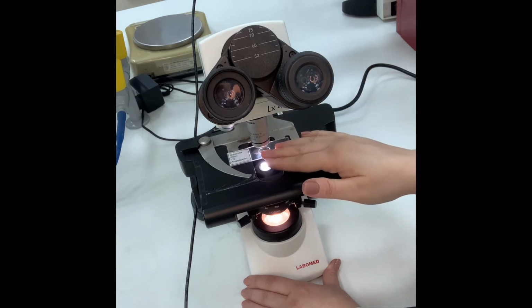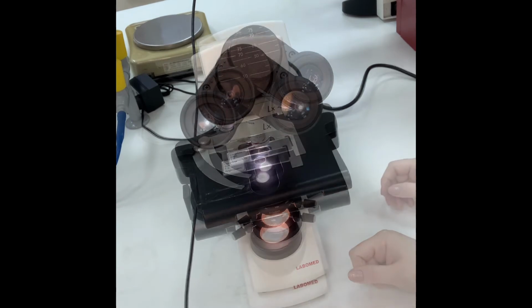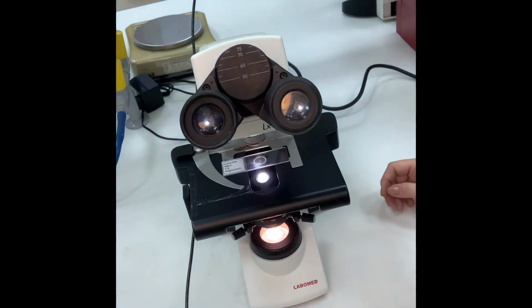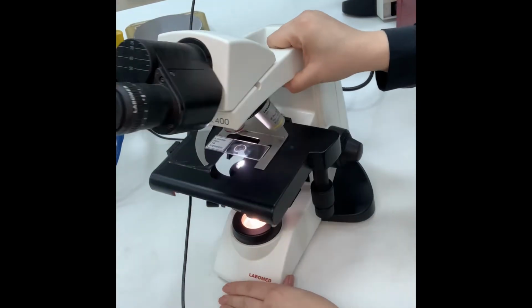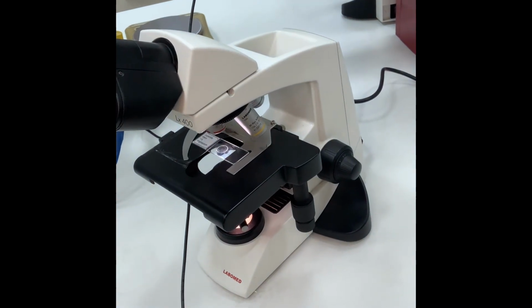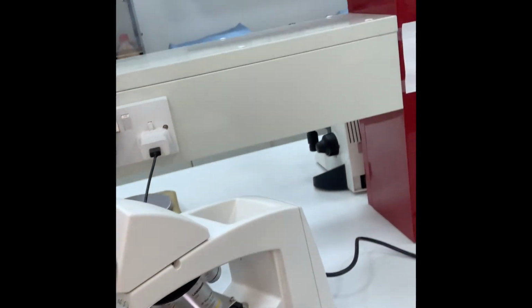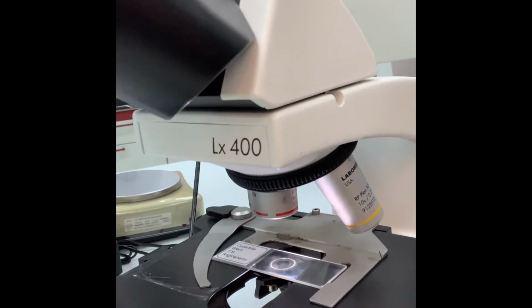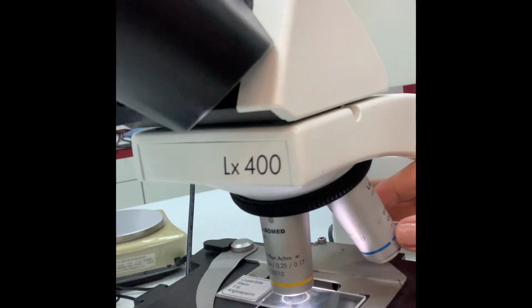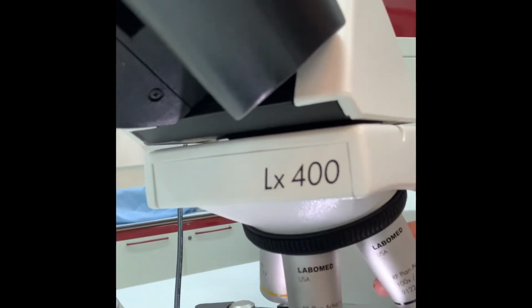Now, because I didn't fix the slide itself, I will show you my point. Now I have fixed the image and I can see it under objective 4x. Now I need you to look. I will show it to you. Now when I move it, see, still it won't touch.